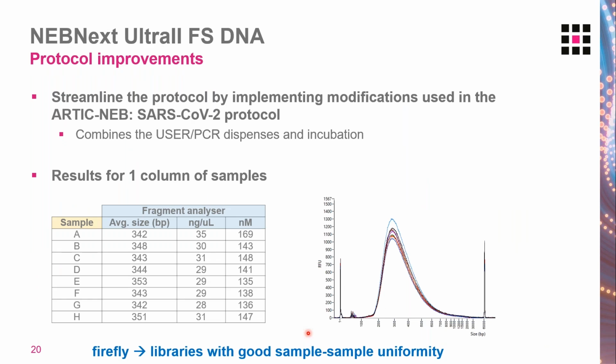So moving on, always keen to make improvements to protocols. I was made aware of a slightly different version of the NEBNext FS protocol. It was used for some of the COVID work. So this protocol actually combines the USER and PCR dispenses and incubation. So in doing this, we have to do one less dispense, one less transfer to the thermocycler. Great. So we tried that out.